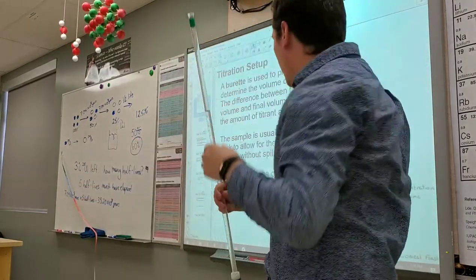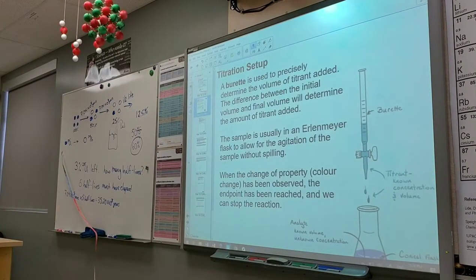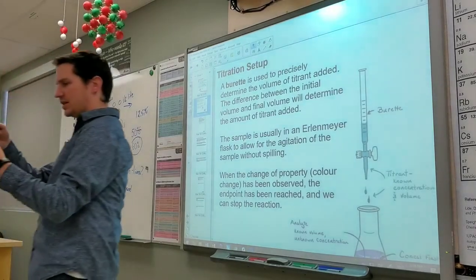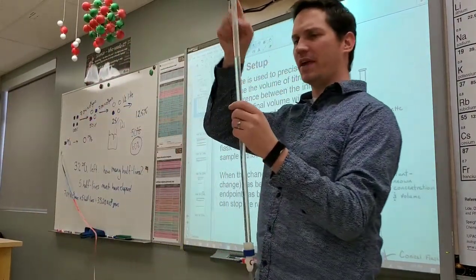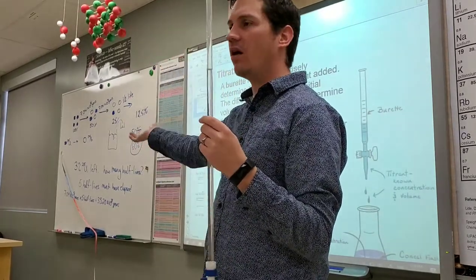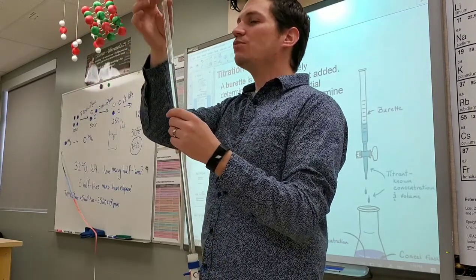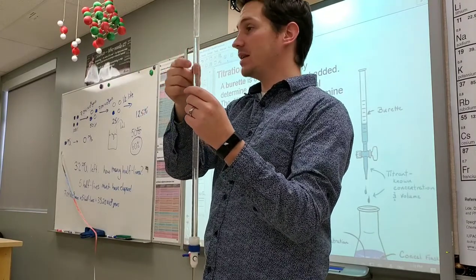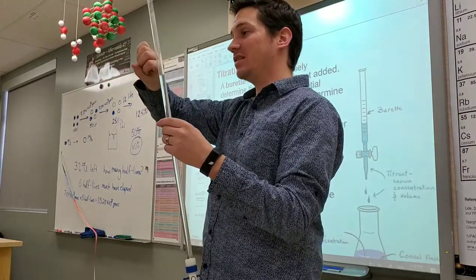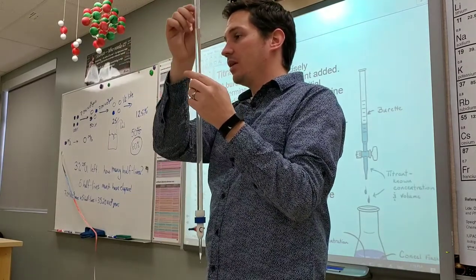Okay, all right, good. Now, when I first filled up my burette, I just grabbed it from a pile of burettes in a couple containers out in the lab. Do I know what the person who last used this burette put inside it? No. Could have been an acid, a base, a redox thing, or just a neutral compound. So what if there was any residue left over, let's say they put a base in here and I'm pouring an acid. What's going to happen if there's a tiny little bit of residue left over? Reaction. You're going to get a reaction.